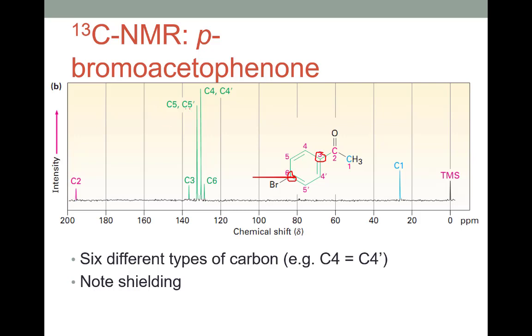And so we see the peak here labeled C5 and C5'. Those 2 carbons are in fact giving 2 signals, but they're overlapping each other perfectly. Likewise, the shoulder carbons here, 4 and 4', are showing up as 1 signal. Now, if we had a different branching pattern such that the symmetry were not there or were different, that would change the number of peaks that we see in the aromatic region. So pay special attention to that when you're going through problems.